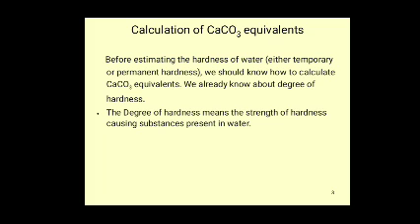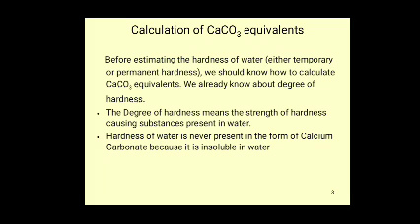The degree of hardness means the strength of hardness causing substance present in water.